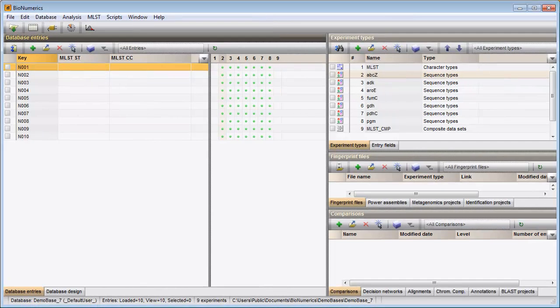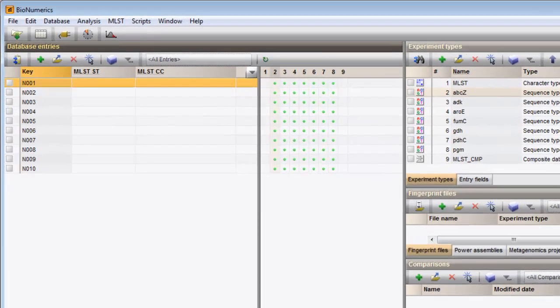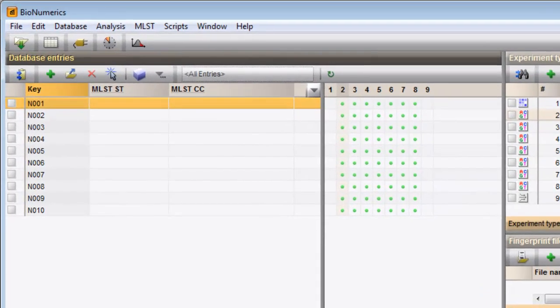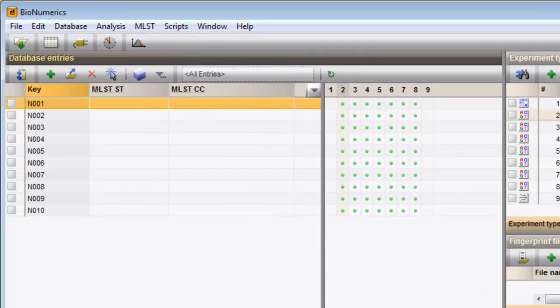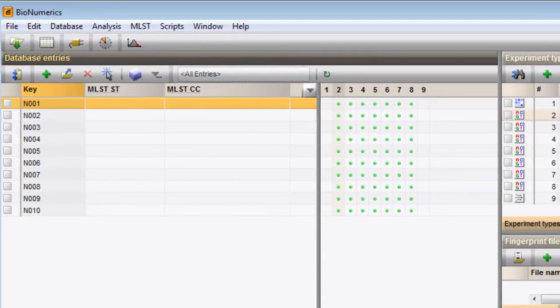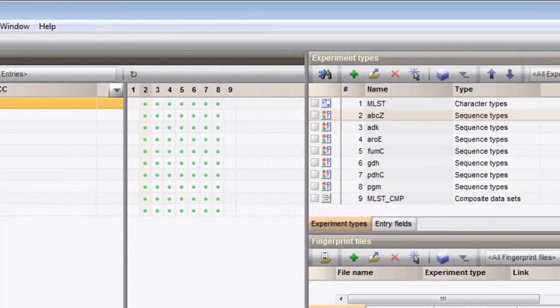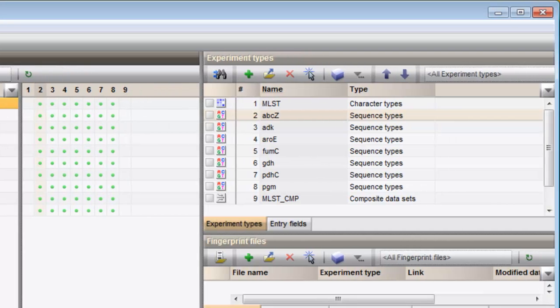In this video I will demonstrate how to obtain allele and profile information for your imported sequences. My entries are displayed in the Database entries panel. All experiments are listed in the Experiment types panel.